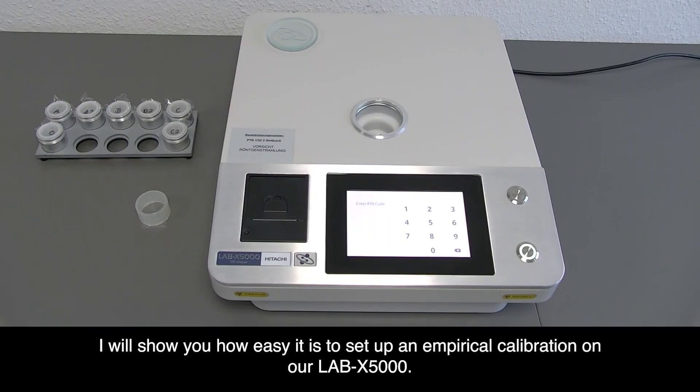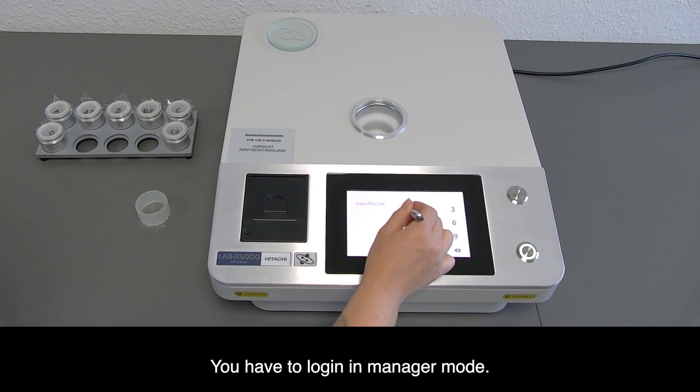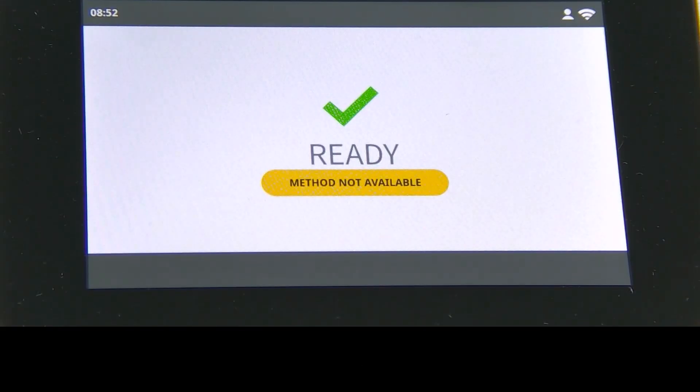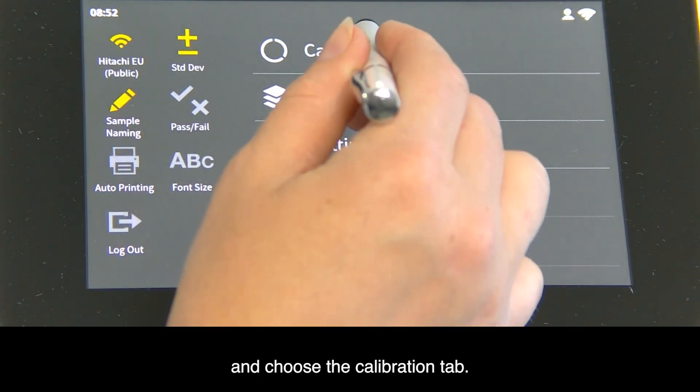I will show you how easy it is to set up an empirical calibration on our LAB-X5000. Just enter the pin code, log in to manager mode, scroll down and choose the calibration tab.